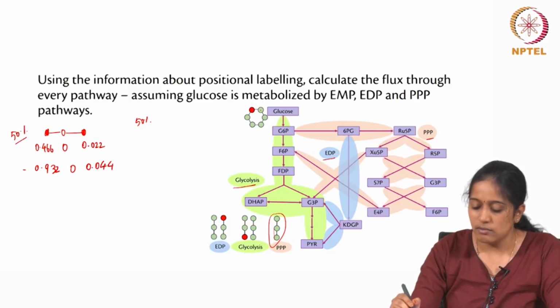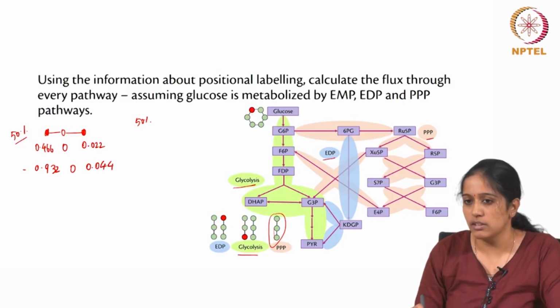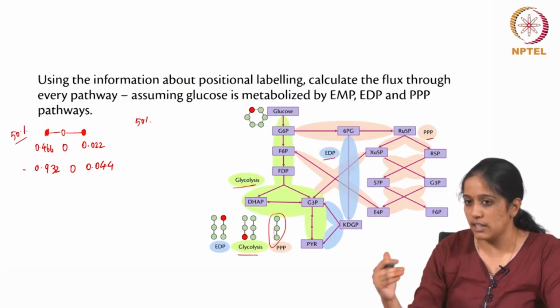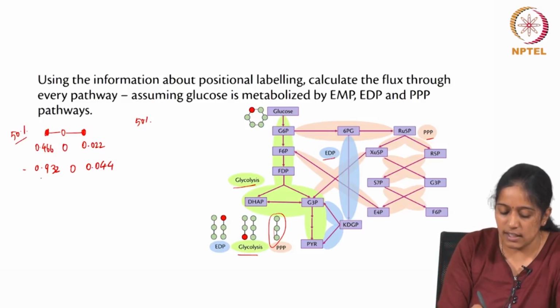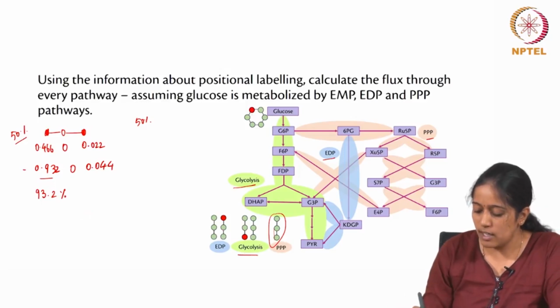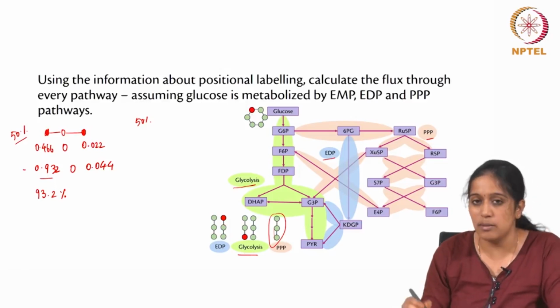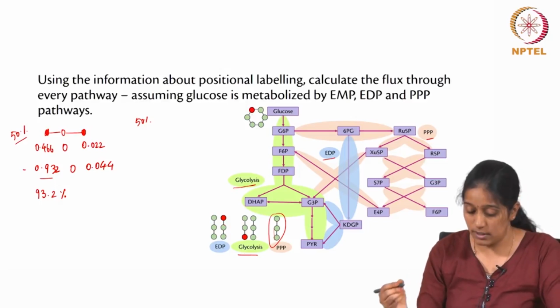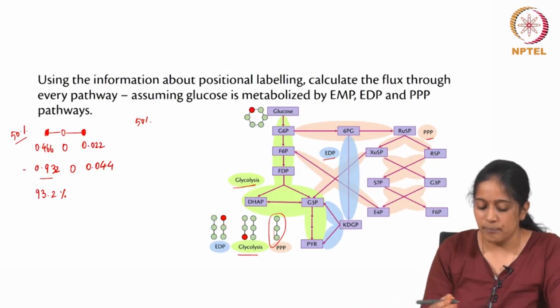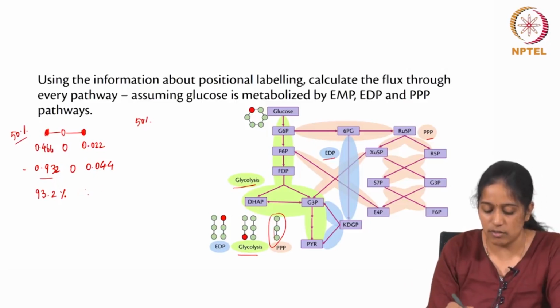From the biochemistry and from the metabolic network, we have the evidence that if pyruvate was produced from one C13 labeled glucose, it should have come from glycolysis because of the different enzymes that act in glycolysis. So, we can say that our flux through glycolysis was 93.2%, and the second carbon has no labels at all. In this case, there is no pathway that can tell you about the second position labeled carbon in pyruvate, so we do not have any evidence of a pathway.